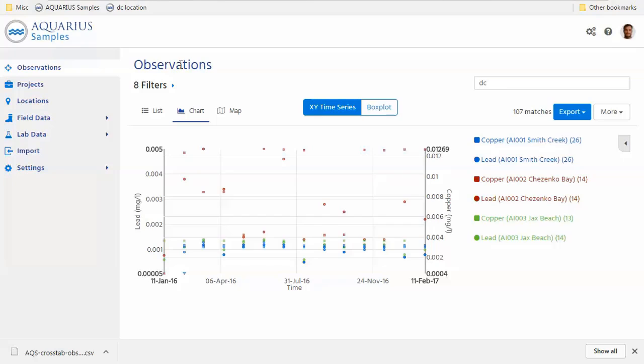So this terminology is specific to the observations and measurements model defined by the OGC, the Open Geospatial Consortium. And we chose to base Aquarius samples on it because it's a science-driven model, which, by the way, is getting adopted more and more. For instance, the Bureau of Meteorology in Australia, the BOM, just released a national industry guideline for water quality metadata. And this is based on the same data model. As a result, the Aquarius sample and this industry guideline are pretty much the same thing, since they're both based on that standardized data model.